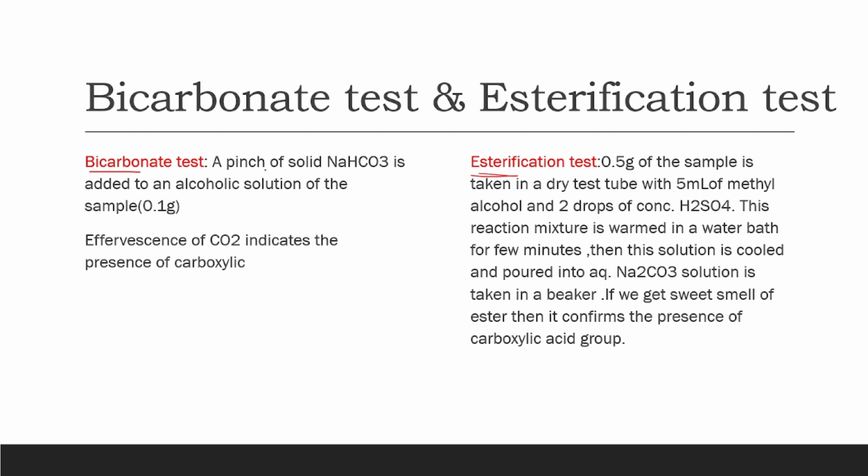Here a pinch of solid sodium bicarbonate, that is NaHCO3, is added to an alcoholic solution of the sample. If we get effervescence of CO2, this effervescence of CO2 indicates the presence of carboxylic acid group. Let's see the reaction during this bicarbonate test. Here this is my sample.